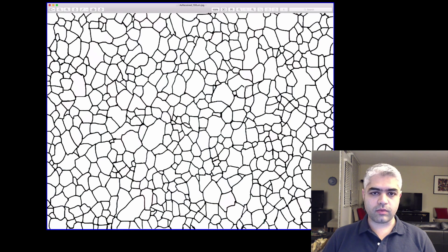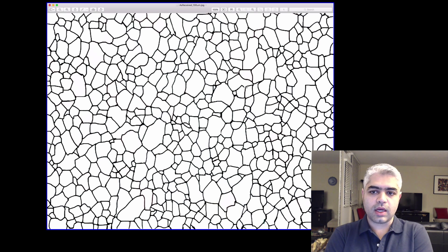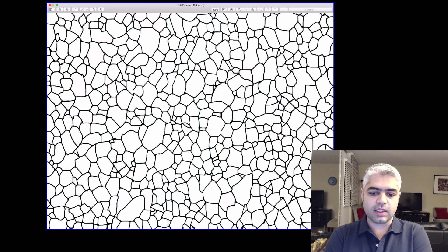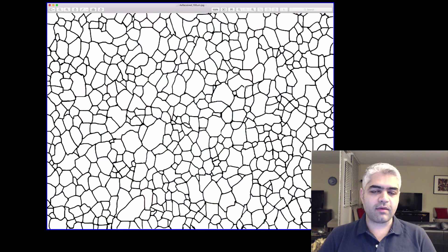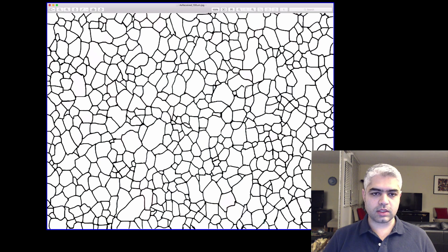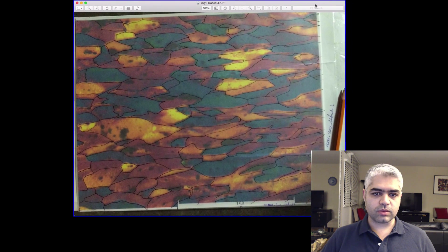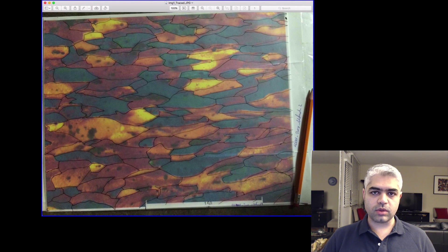The matrix should be white and the grain boundaries should be black. This is the way that I've made this code. You can inverse your image easily in any software or add an inverse function inside this code. I also need to have the deformed structure.